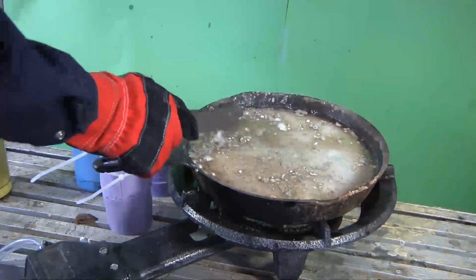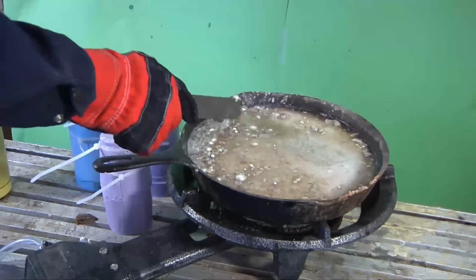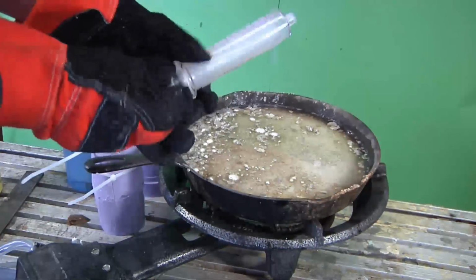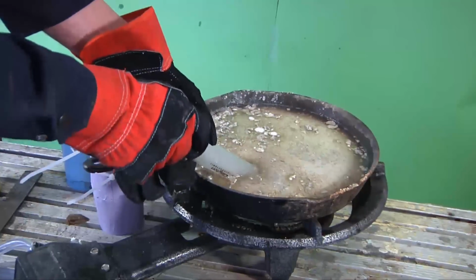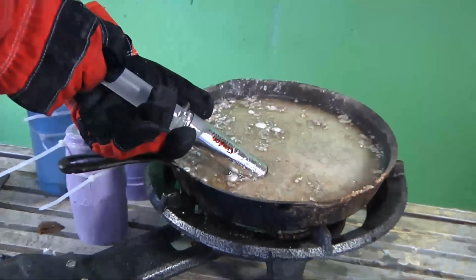So instead of worrying about all this contamination on the surface and worrying about how to get rid of it, what I like to do is I just like to use a syringe. This is a glass syringe. It's pretty nice, reusable. It withstands the temperatures of the sodium really well. So I'm just going to suck some sodium up, very silver, and push it back down.